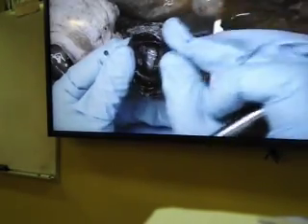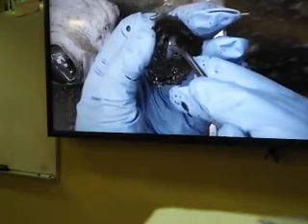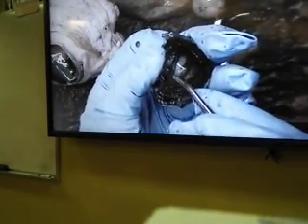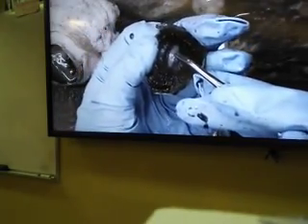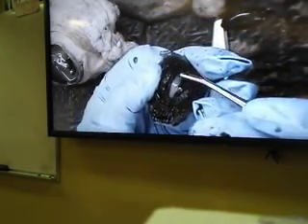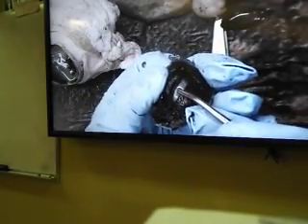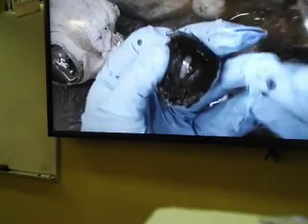And the moment you go to the back, I may ask you again, name the structure. Make sure you understand, since the probe is showing to the cornea, but from the back, the structure is still cornea. You may say, well, structure, can it be pupil? No, it cannot be pupil, because pupil is not a structure, pupil is a hole. Pupil is a hole, so whenever we are asking, name the structure, putting our probe right in here, we are actually asking for the cornea. If we ask you for pupil, we will ask you name the hole.